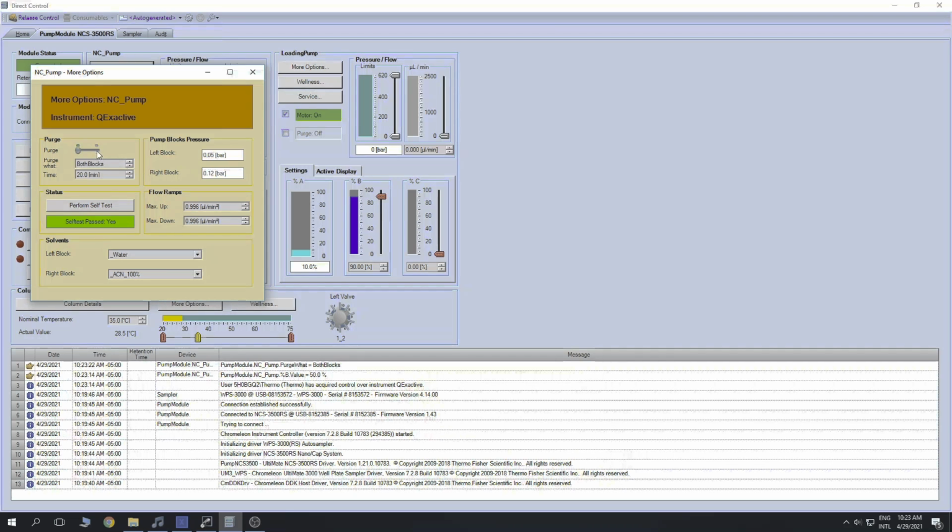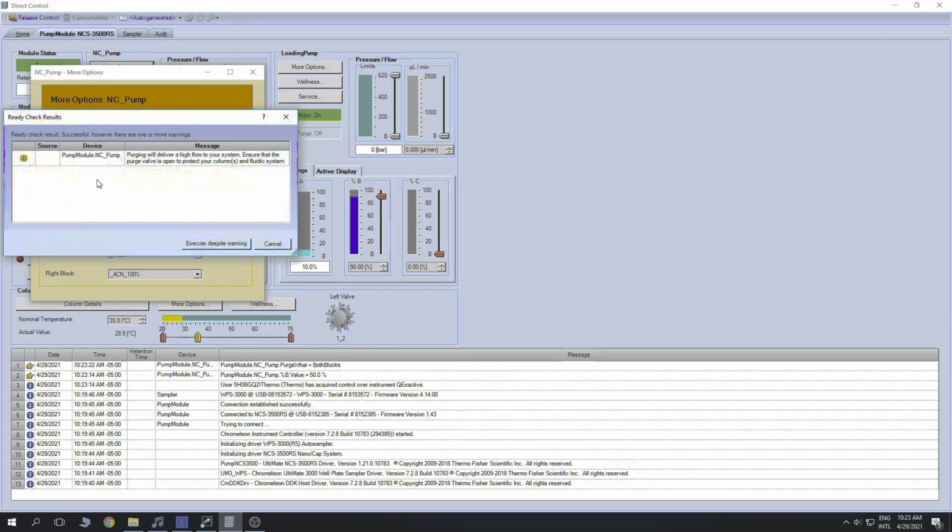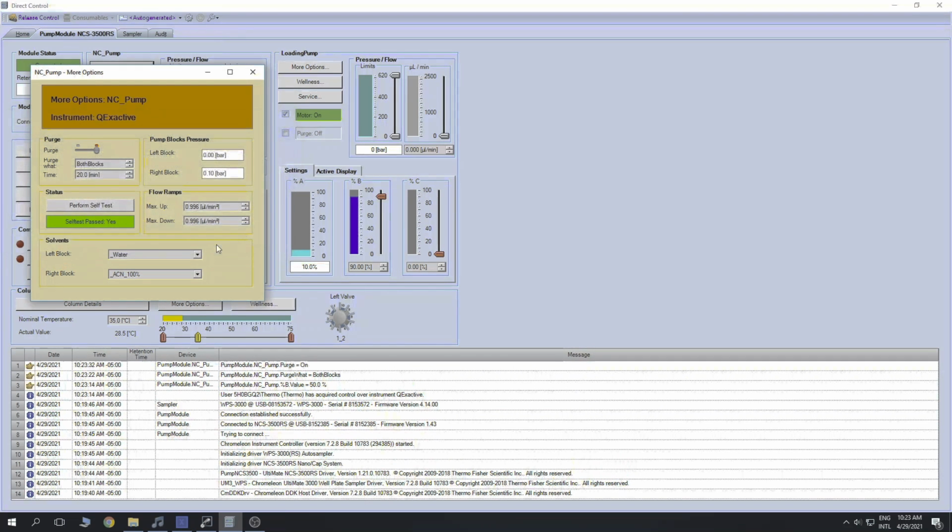You'll turn the purge on, and the instrument will deliver a warning that says this is a high flow and to ensure the purge valves are open. So this is just a second reminder to make sure that you had opened those purge valves before you stepped over to the computer. And then you'll come back in 20 minutes when the purge is concluded.